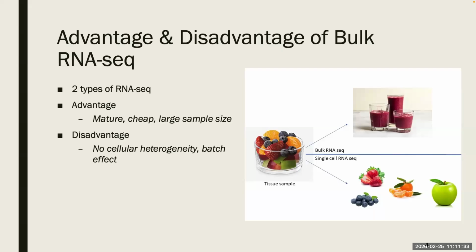Batch effects are non-biological variations that occur when samples are processed in different groups. Batch could come from being processed at different times by different people or using different sequencers. Since bulk RNA sequencing usually encompasses a large amount of data, they're usually collected from different sites. Hence, we need to remove the batch effect.